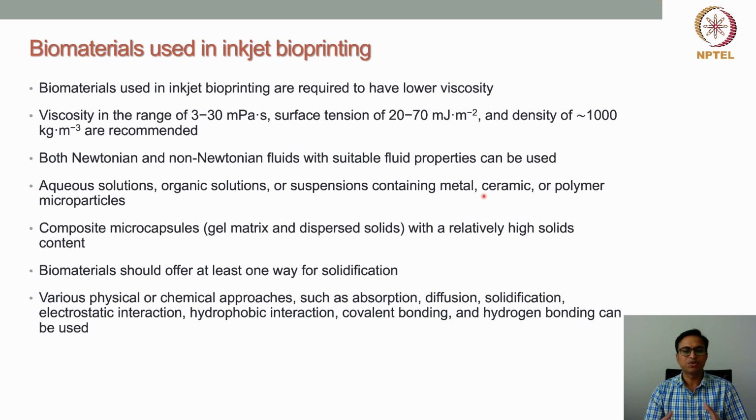Diffusion: there can be a diffusion of molecules or diffusion of ions, by which gelation or solidification can be achieved. Again, solidification can be achieved by various other means. For example, there can be electrostatic interaction, because of which the formulation gets solidified.